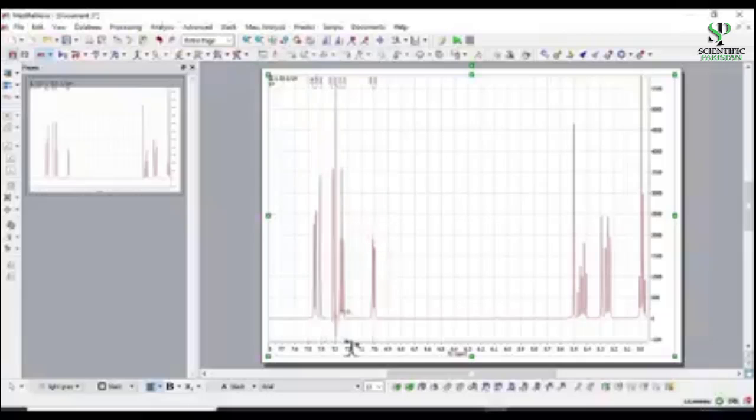Yes. So we are working here in the aromatic region. 7 to 7.5 is the aromatic region. These are the peaks in the region from 5 to 5.5. These might be olefinic signals, and you can select them manually. If you want to do the automatic pick, you can do that as well.